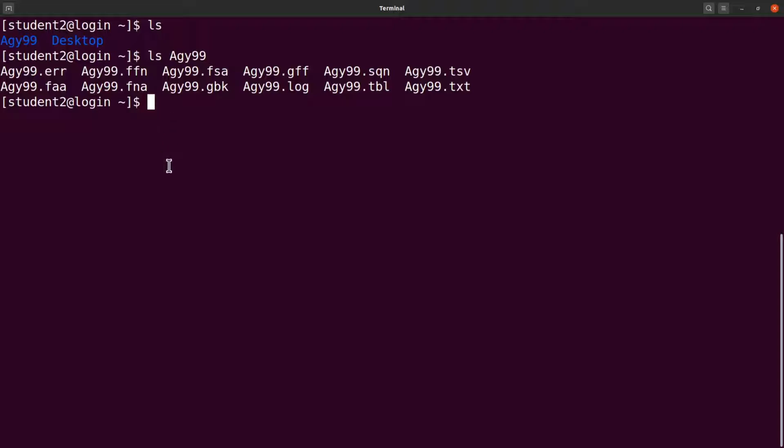This leads me to the next part of the video, where we explore some of these files to get some information for us. So let's first cd into that directory. Now, we will focus on just this, and then this.